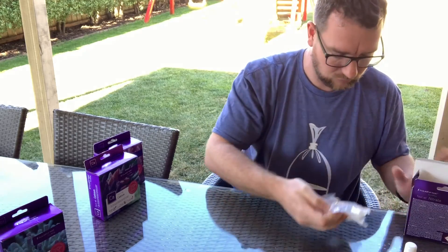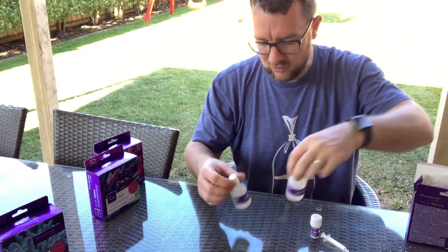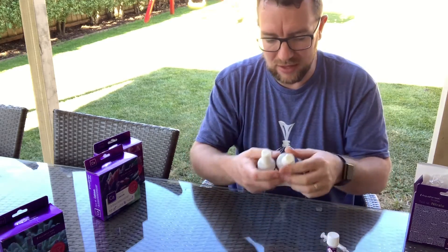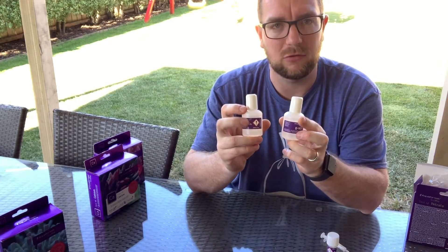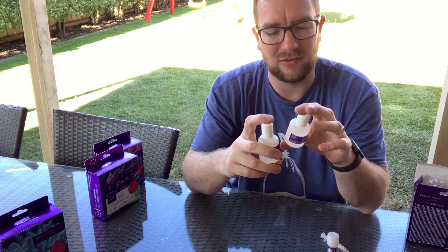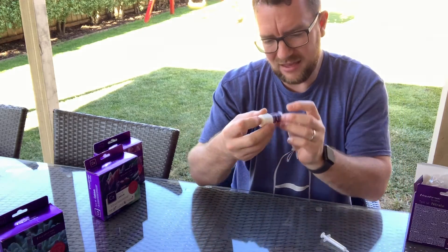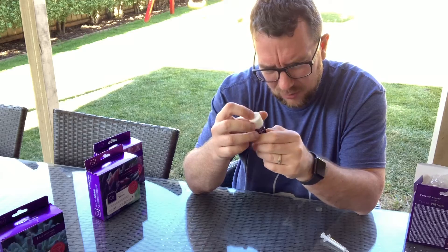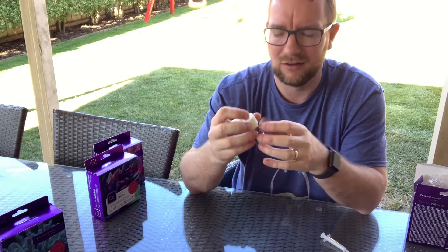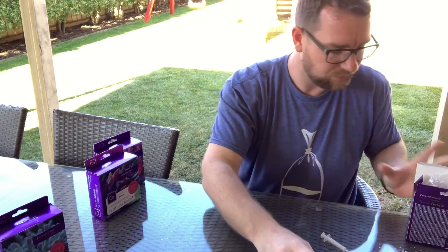One big plus I've always loved with the Aquaforest kits: they give you two bottles of Reagent B, which is a solution, while Reagent A is a powder. You can leave one bottle sealed, which gives a little more longevity to the kit. Reagent A is quite a fine powder, which is good — with some kits the powder can be crystallized and clumpy, making it hard to get an accurate scoop.